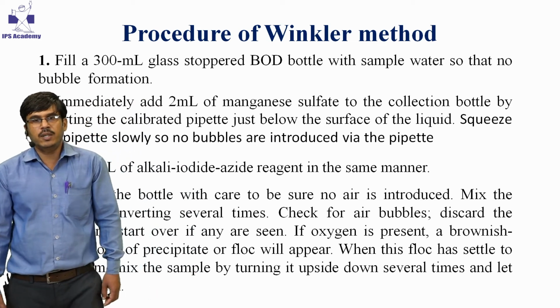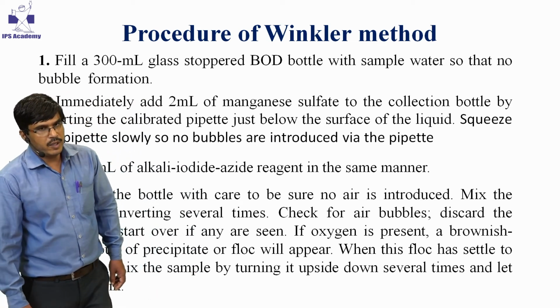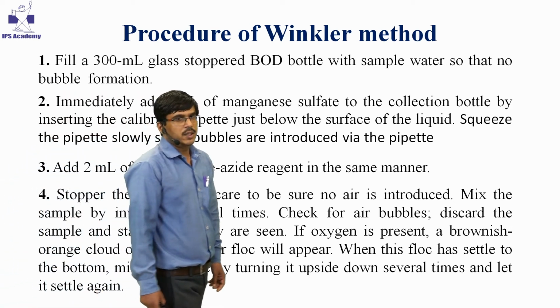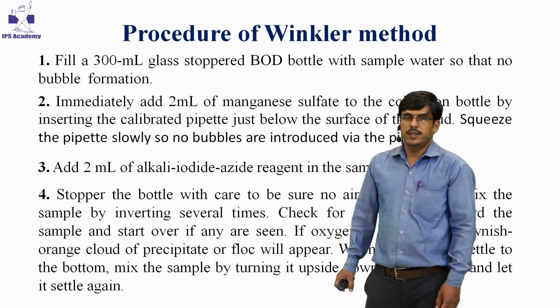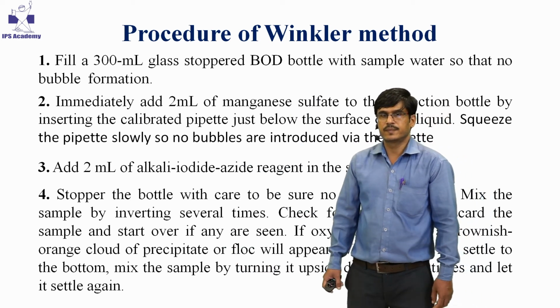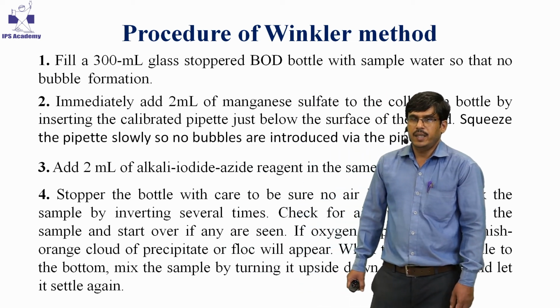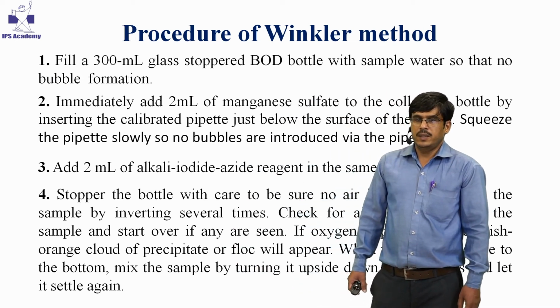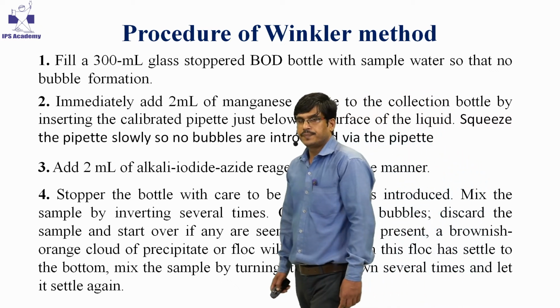When this floc settles, again we have to shake the bottle by turning it and mix the sample several times and let it stand for settling again.